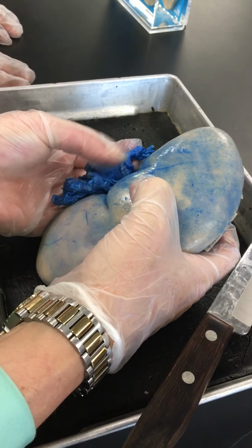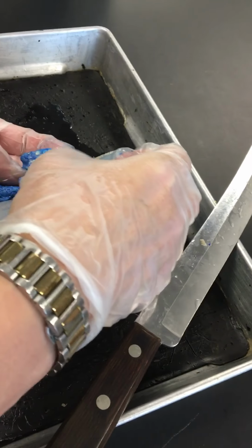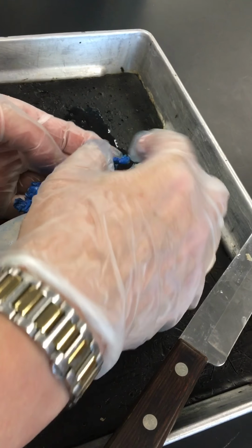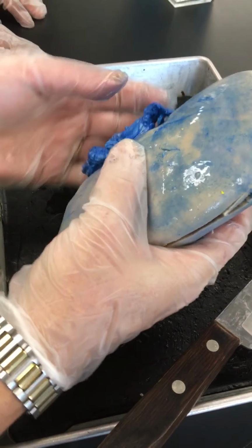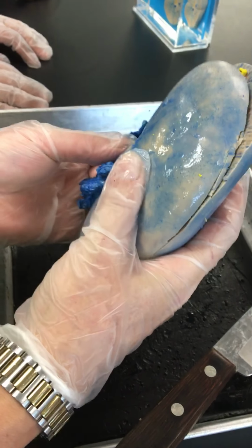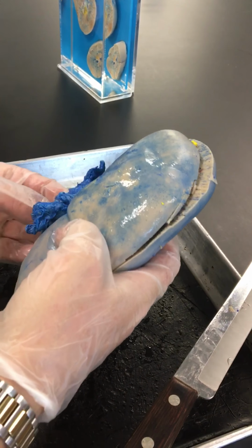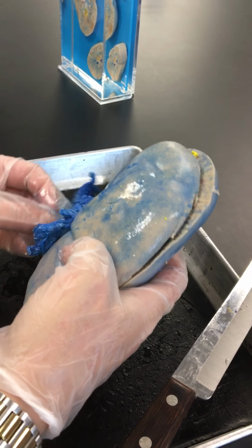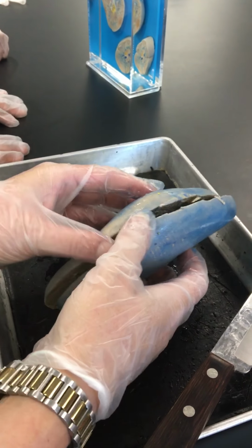So you can see the thickness of the vessel right there. So this is the artery there. It's just obliterated in the blue, but you can see the tube in there. So if we position that as the ventral side, then this is going to be a left kidney. Because again, we want our ureter facing downward, and then the renal artery on the ventral side.